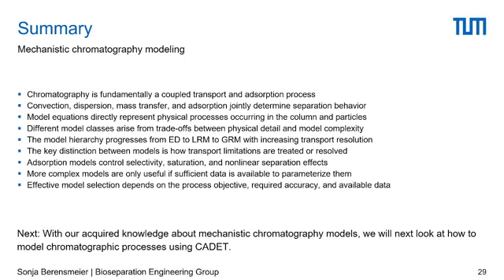So we have a short summary here at the end of what the important key takeaways from the mechanistic modeling for chromatography are. First, that chromatography is a fundamentally coupled system. So we have a coupled transport and adsorption process that we can well describe with different independent model systems. We have convection, dispersion, mass transfer, and adsorption, which are all important for the separation behavior. And we have model equations that directly represent the physical processes happening inside our column.